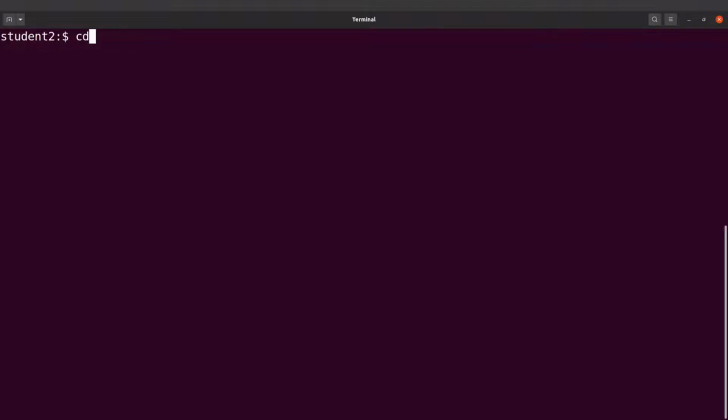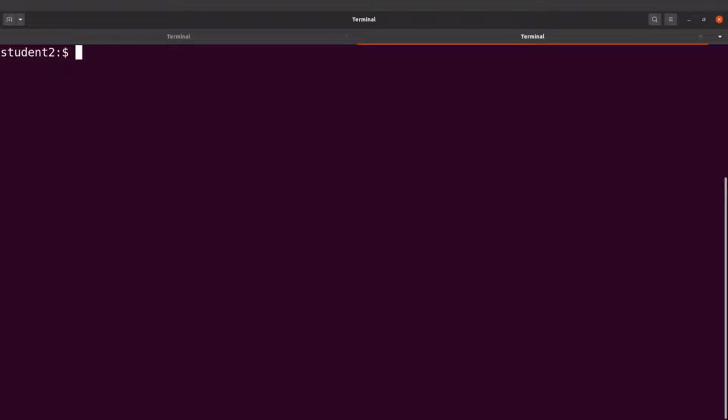Let's just proceed. Let me show you what I mean. Let's open a new terminal. We have opened a new terminal, so if I say spades.py, this is what will happen. Okay, it's because that export command was executed just on that terminal.